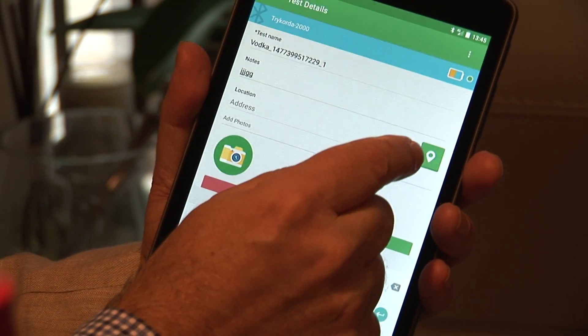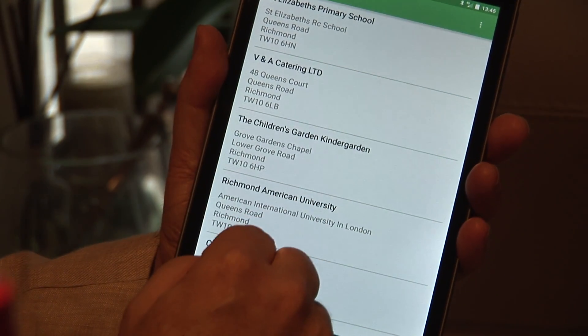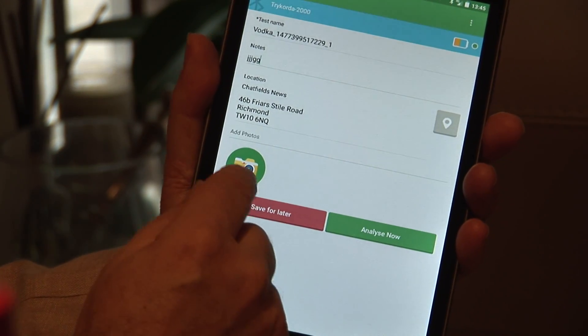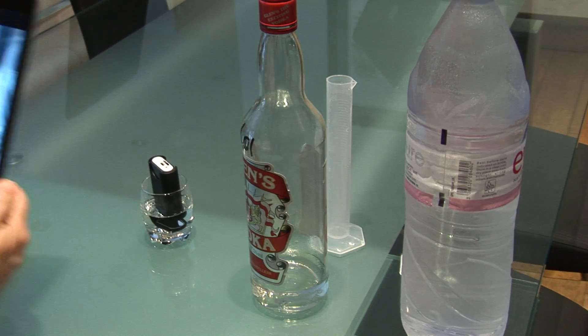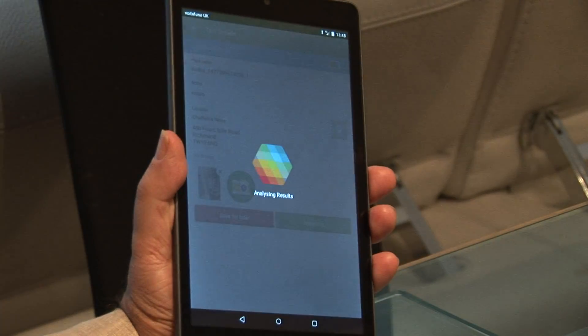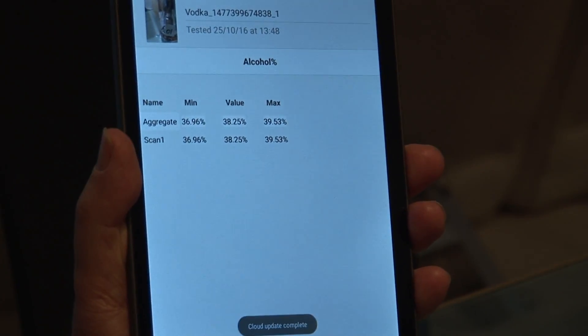From there I can enter some details about the test — we can select the location where the test is taking place, and we can take a photograph of the sample so that I know which one it actually is. Once I've done that, we can analyze it and see the results straight away.